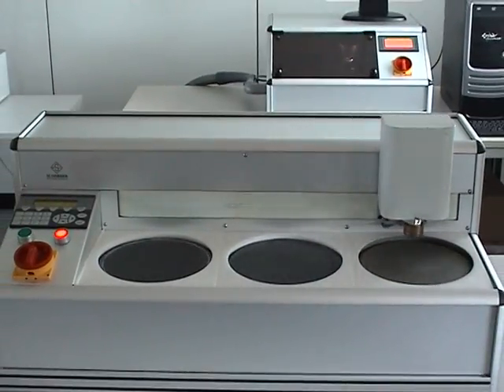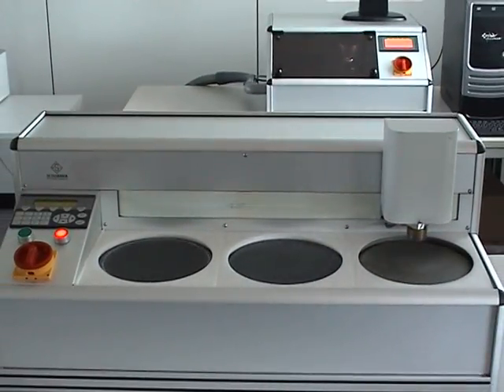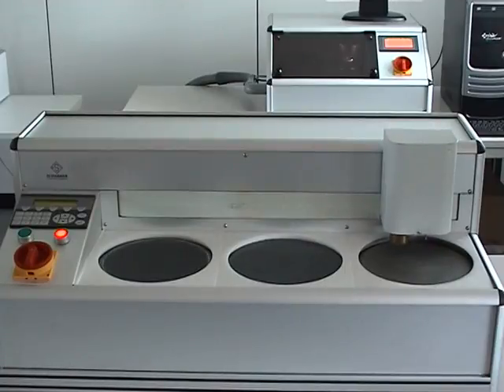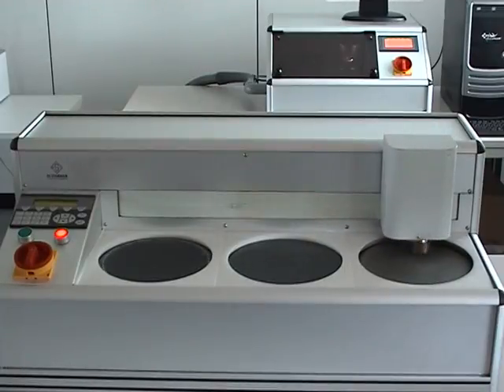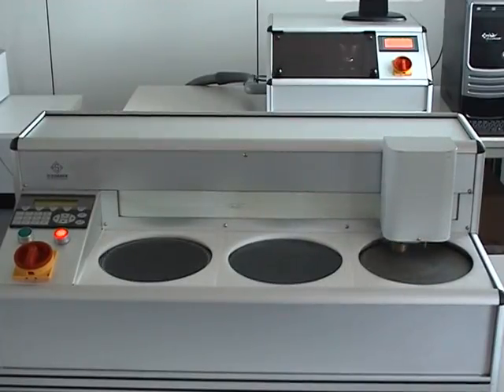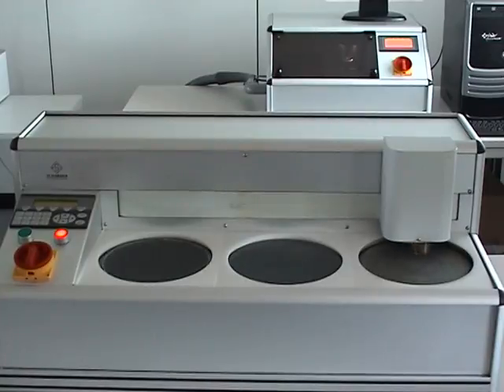After completing fine grinding, the machine will continue with polishing. Polishing time can be programmed as well.